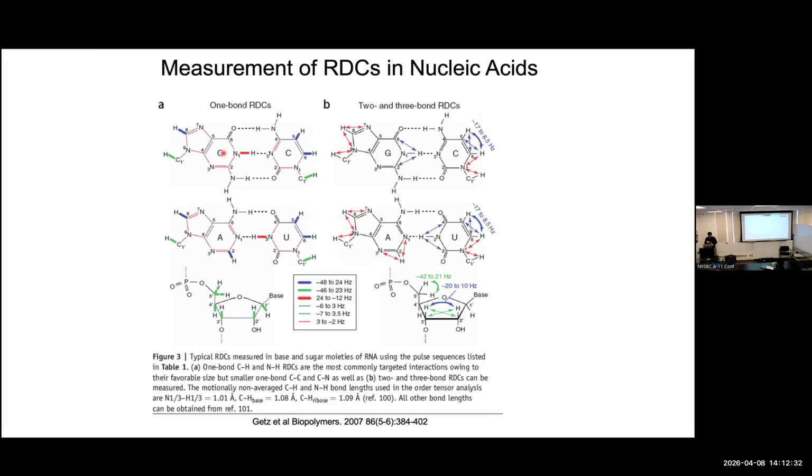And so you need to know the bond length to analyze RDC levels. That's not assumed to be known. Now, imagine that I screw up and I say the NH is 1.04, and in the CH bond I use a wrong bond length, like 1.2 angstroms. Those two sets of RDCs are not going to be able to be reconciled.